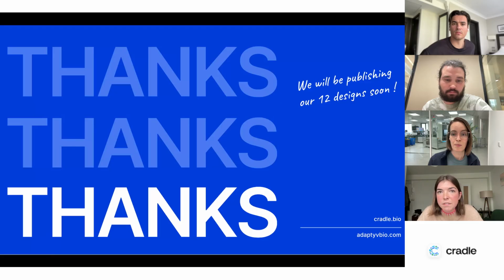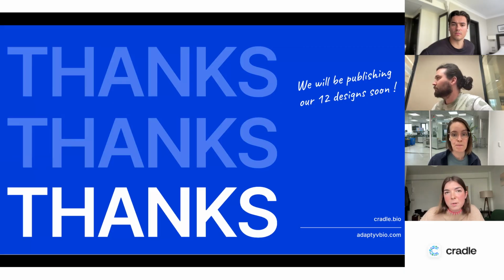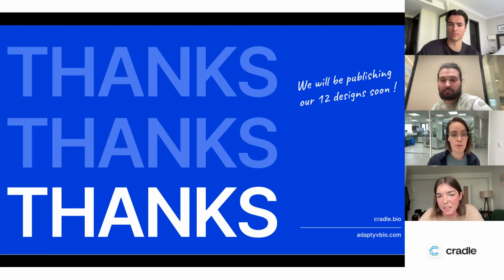And basically for an assay to be used by Cradle, we need it to be a property that you can assay in the lab for a plate of sequences. We need at least 100 sequences approximately, or 100 data points, for it to be useful for our algorithms. So it can't be a low throughput assay, and I know that can be the case for some of these developability assays. So that's a limitation that we have.